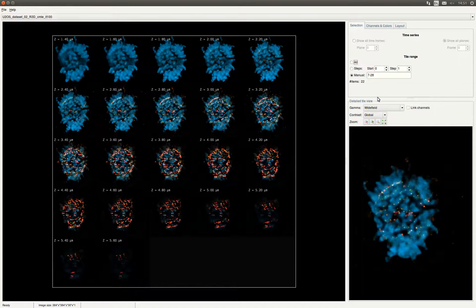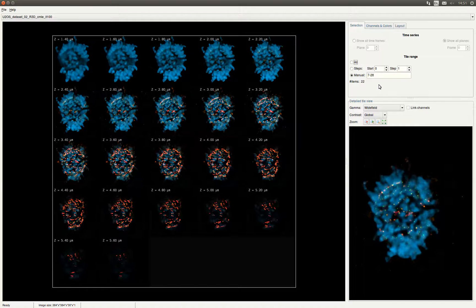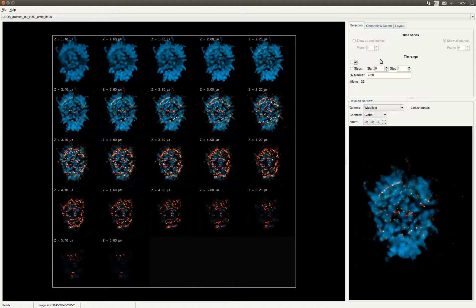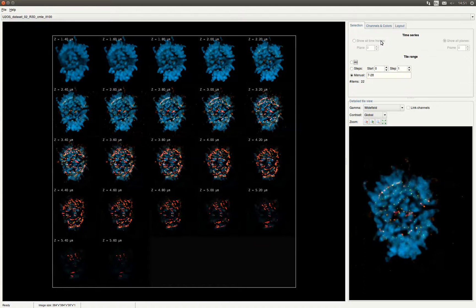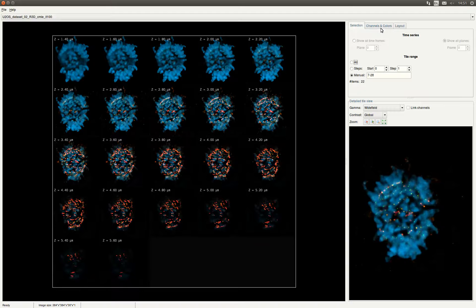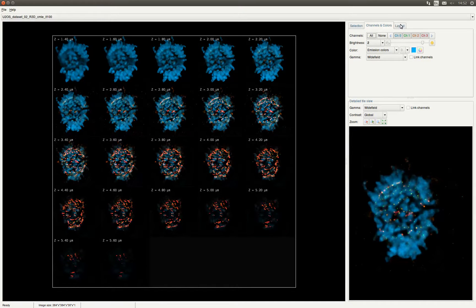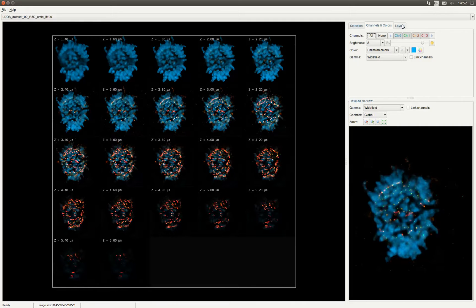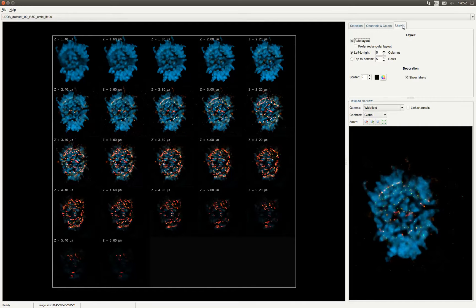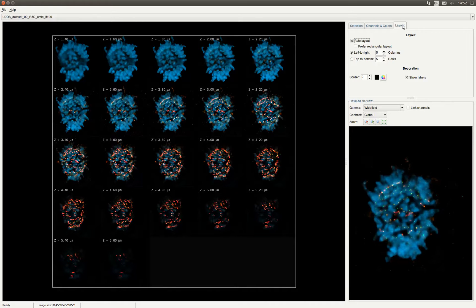Under the selection tab you can make a selection of the time frames or Z slices you want to view. In the detailed tile view in the bottom right of the screen you can see a larger view of a tile and zoom or change the gamma. Furthermore you can change the color of channels and enable or disable channels in the channels and colors tab. In the layout tab you can change the layout of all the displayed slices or time frames.